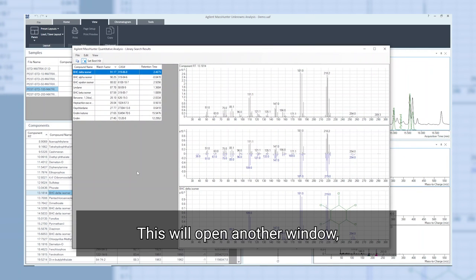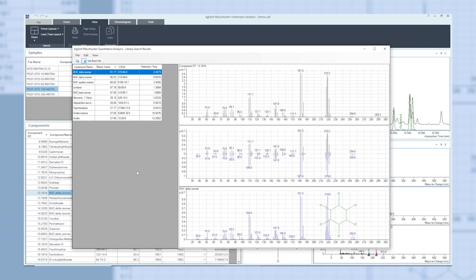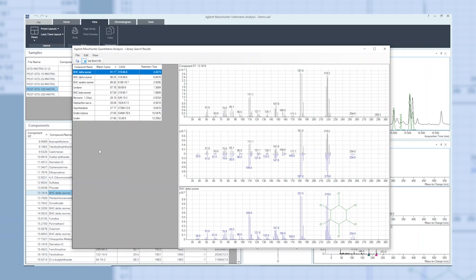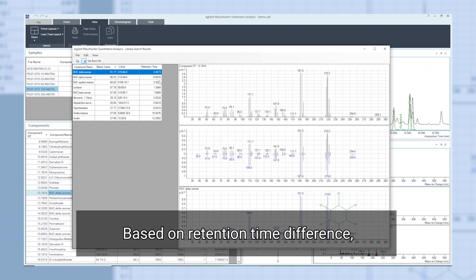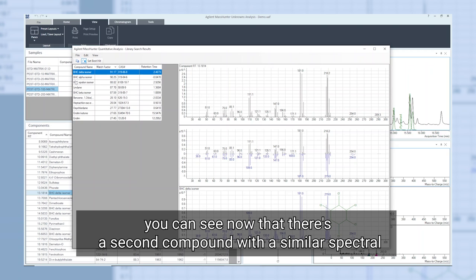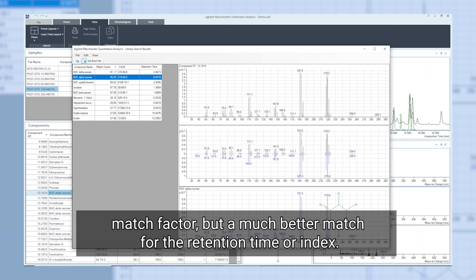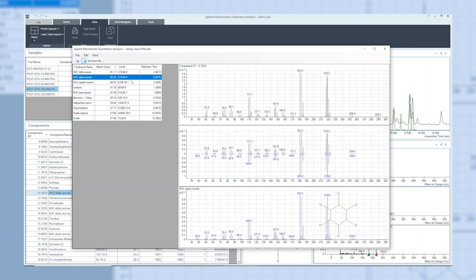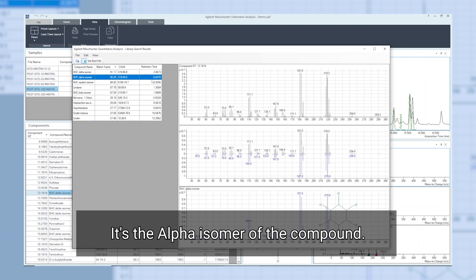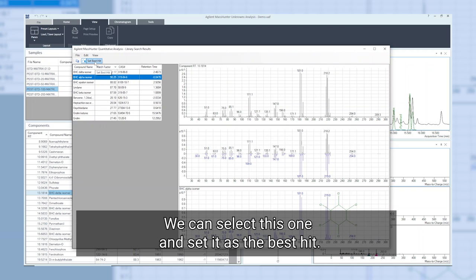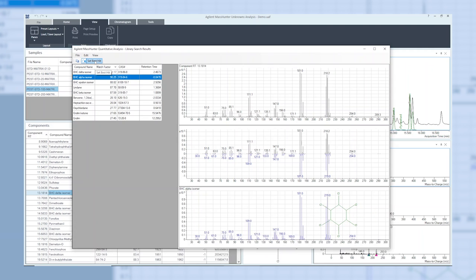So we can go ahead and right-click on the compound and go to show alternative hits. This will open another window and we can see an extended hit list. Based on retention time difference, you can see now that there's a second compound with a similar spectral match factor but a much better match for the retention time or index. It's the alpha isomer of the compound. We can select this one and set it as the best hit.